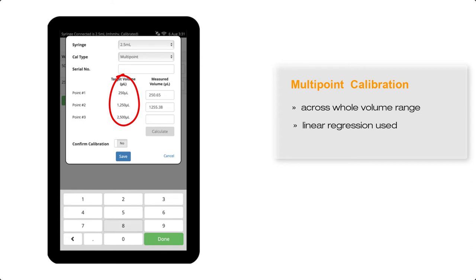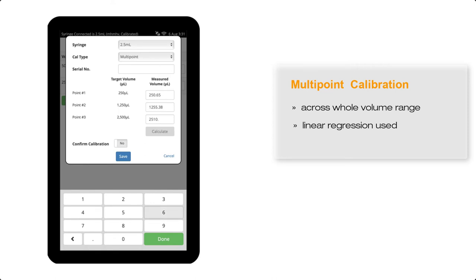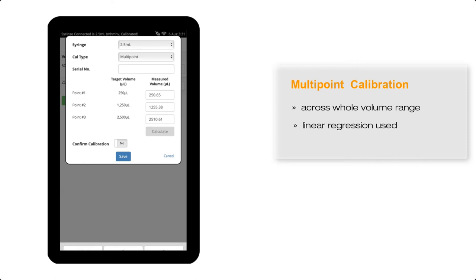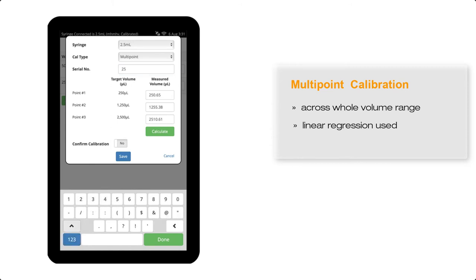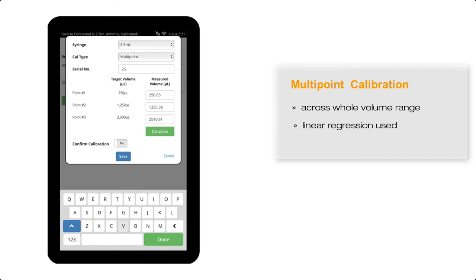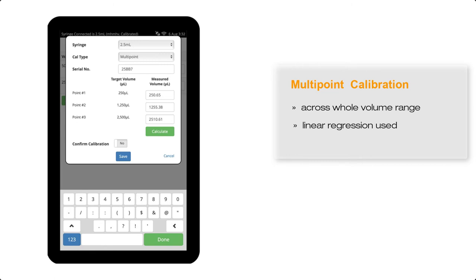Therefore, for the 2.5 mil syringe, you can see here the target volumes are 250 microlitres, 1,250 microlitres, and finally 2,500 microlitre volumes. We have weighed out the water for 10 replicates for each of these volumes and adjusted for density. The volumes entered are 250.65 microlitres, 1,255.38 microlitres, and 2,510.61 microlitres.